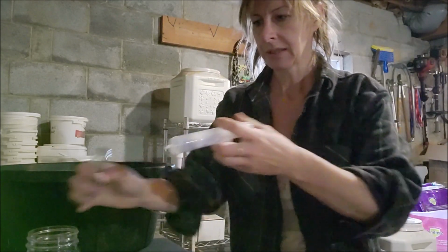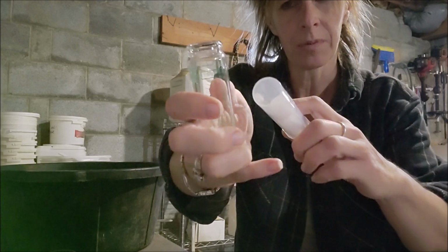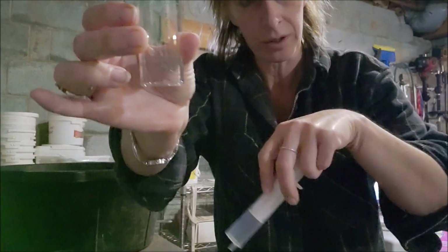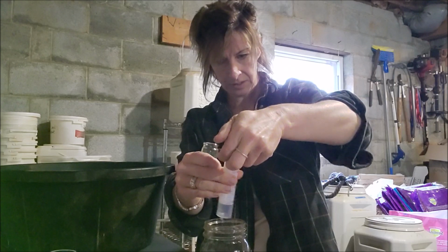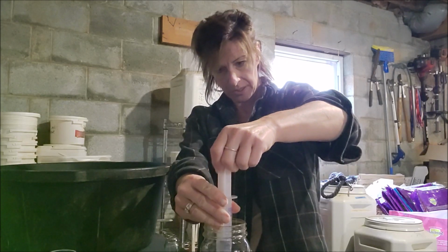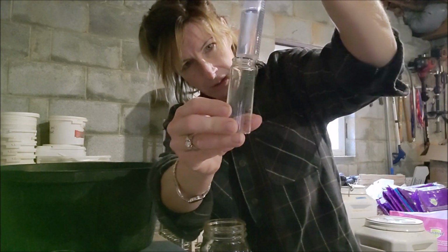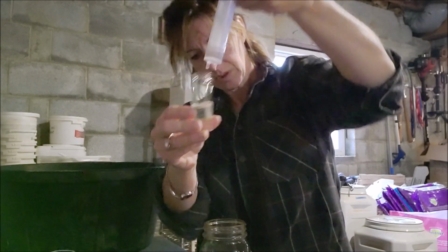So you want to take some of your fecal solution, draw it up in here, and put it in here up to the line where it says 26 milliliters. So we're going to fill it up to here. And then from here to here, we're going to fill it up with the poop. So we're going to draw this up in here, make sure that it's full. Should probably have this on a bucket or something so you guys can see, but there you go. And then you take the solution, and we're going to need some more.